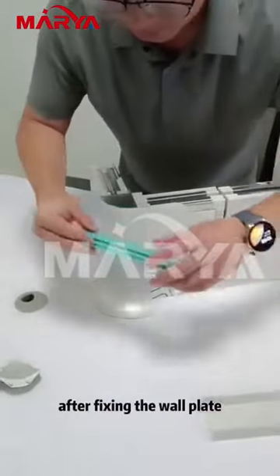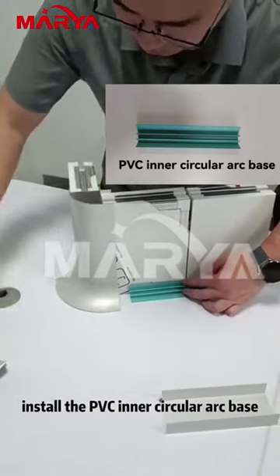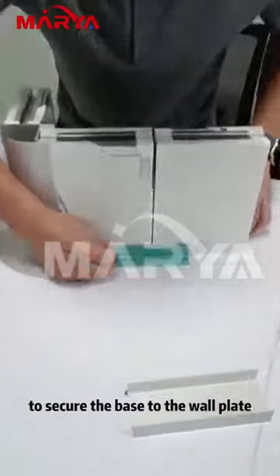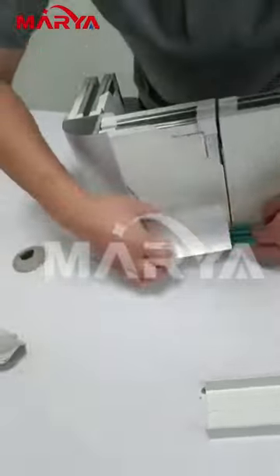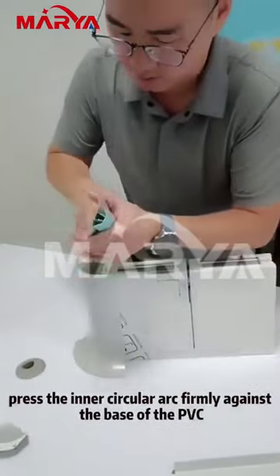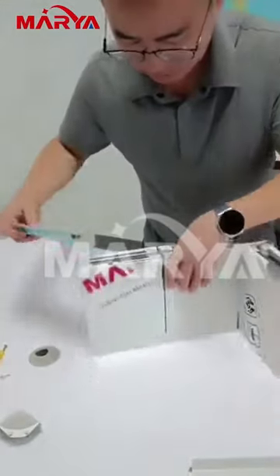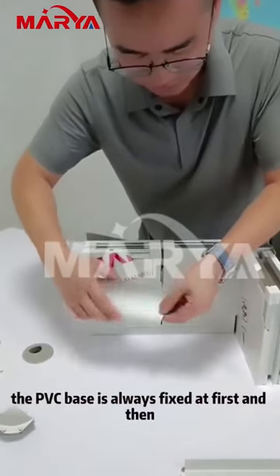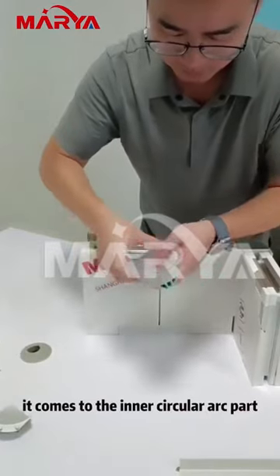After fixing the wall plate, install the PVC inner circular arc base. Use round-head dovetail screws to secure the base to the wall plate and attach it to the aluminum track. Press the inner circular arc firmly against the PVC base to secure them to the wall panel. It is also the same inside — the PVC base is always fixed first and then the inner circular arc part follows.